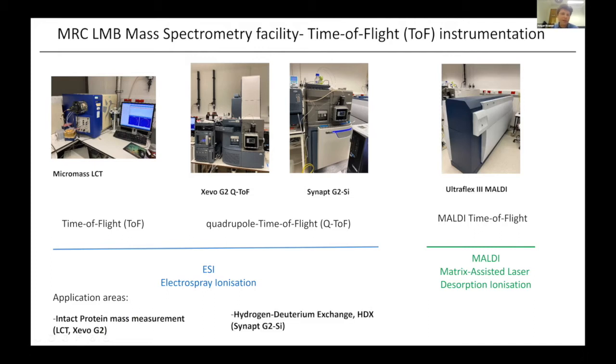it fully. And then the SYNAPT we typically use for a different application that's referred to as hydrogen-deuterium exchange mass spectrometry, or HDX. That is another structural proteomics approach, which allows you to look at accessible residues on a protein surface that are able to exchange with the solvent.